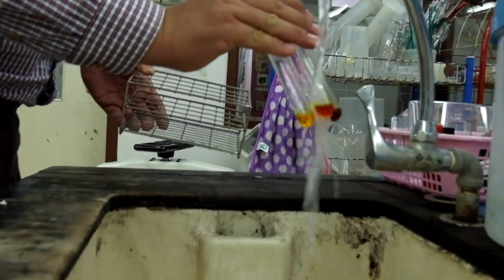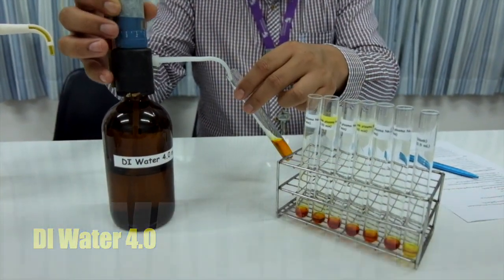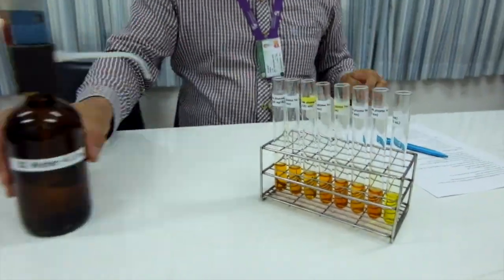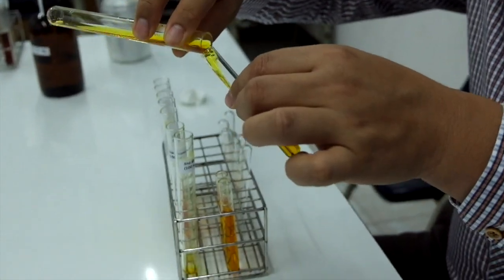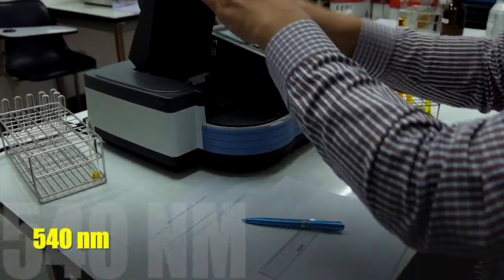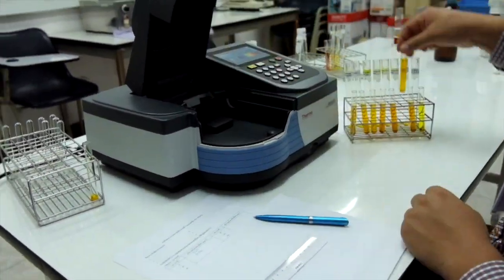After that, cool the solution down through the running tap water. Add 4 ml of distilled water in all test tubes and mix well. Pour a certain amount of the solution in each test tube into cuvettes. Measure the absorbance of all cuvettes at 540 nanometers using the distilled water sample tube for setting 0.